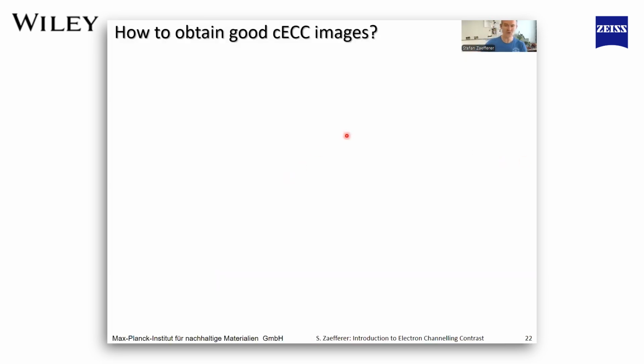Coming a little later: how do we get these beautiful pictures which I have shown you? One of the tricks is that we need almost parallel illumination. In TEM, we take images of dislocations under parallel illumination. That means in an SEM we do not want a convergent beam, but a parallel beam. That is something which is not so common in an SEM. You would usually like a convergent beam in order to have a small spot size.